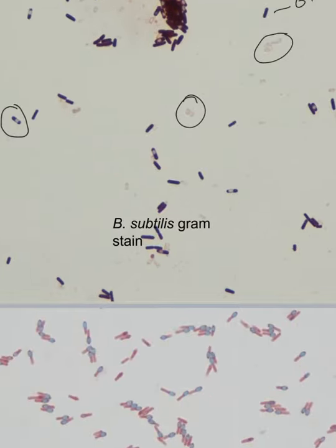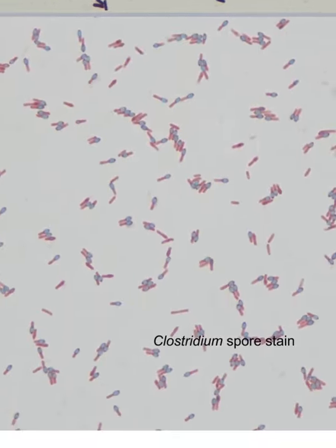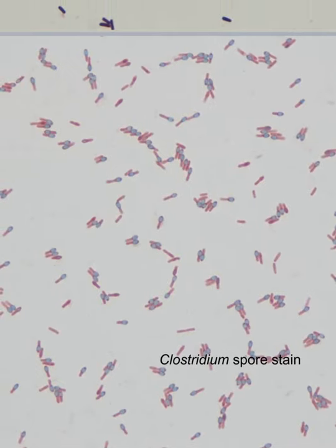All right. And one other picture to show you, this is, I'm not sure which species of Clostridium this is. I believe this, I can't remember if this was a picture I took or not. It kind of looks like it might have been. It's a little bit harder to make out the colors here, right? We'll call these spores green, even though they're pretty light. But you can see the terminal spores. Here the spores kind of swelled up a little bit. Sometimes we call those tennis racket spores. But that's more often the Clostridium will have spores that look like that.